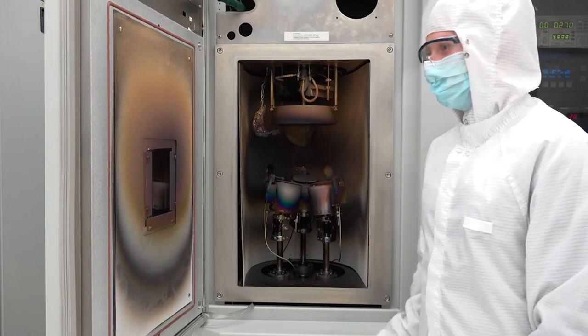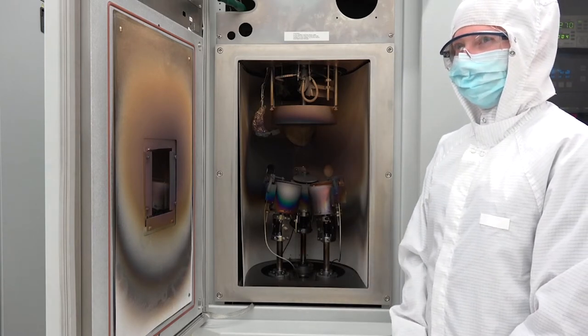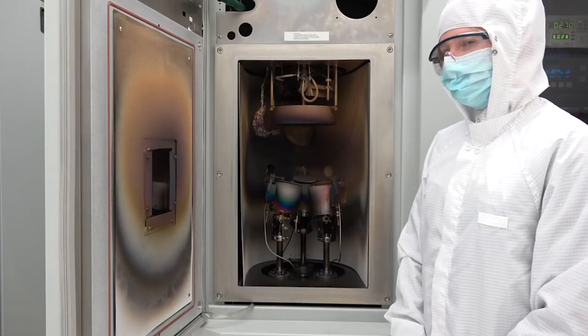There are several interesting things to see in the sputter system vacuum chamber. First, we have a port for the turbo pump. You can see the turbo pump turbine fins behind the protective screen. Attached to the turbo pump, but hidden from view, is a mechanical backing pump that assists the turbo pump. Next, we have a small port used to feed argon gas into the chamber. The argon will be ionized to form the plasma.